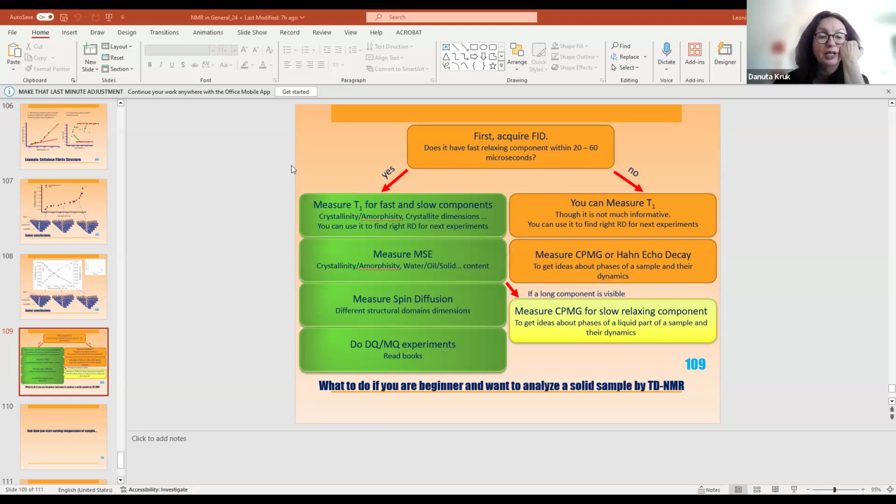And this is something I cannot get. Are you sure that deuteration is 100% done? 90.9. It's never 100%. When you deuterate a sample, there are always sites that do not exchange with deuterium.